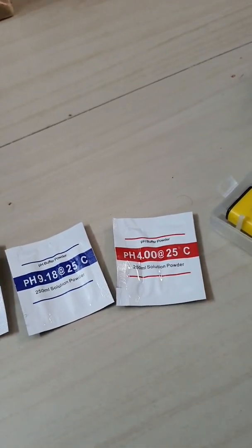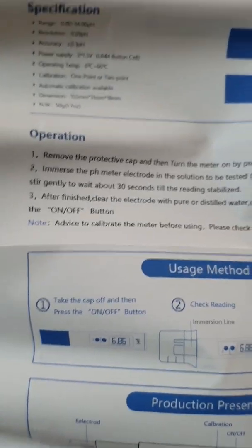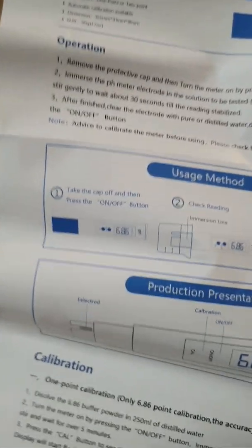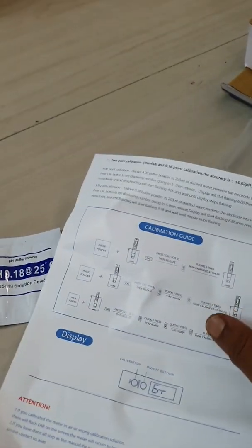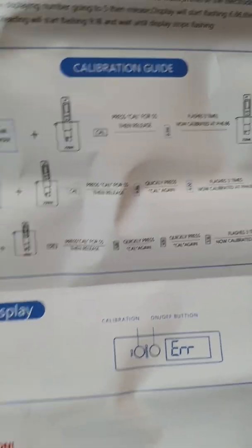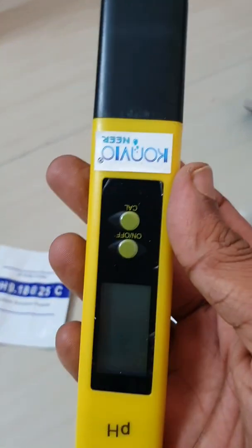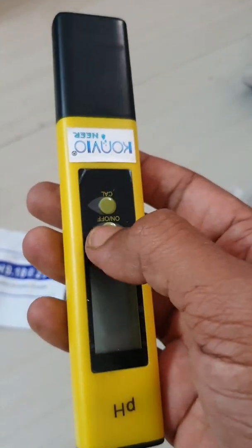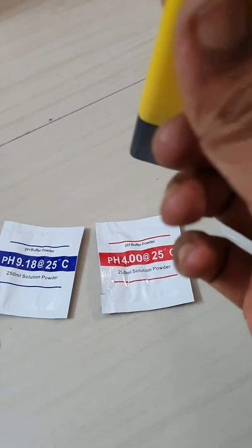I'll shortly make a video on how to calibrate, because I don't have distilled water right now. Once I get it, I'll make a video on that. There are also usage methods listed. Now, coming to the meter itself — here is the meter. There's the on/off button and the calibration button.